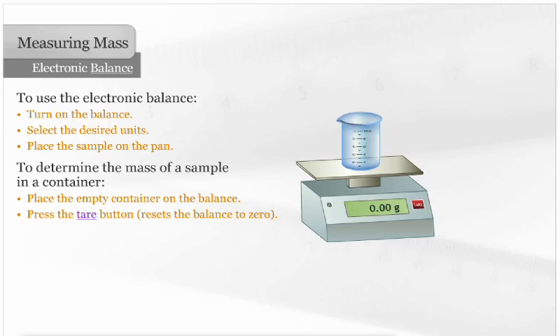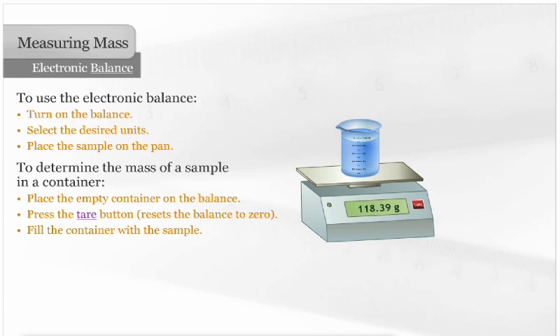This resets the electronic balance to zero. Fill the container with the sample, and the mass of the sample will appear on the screen.